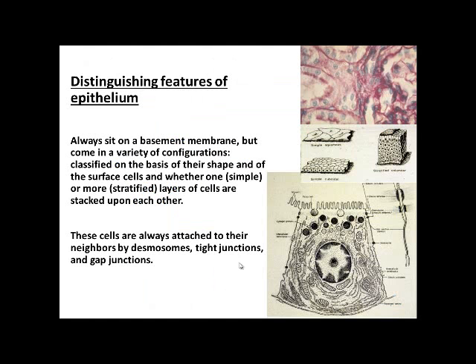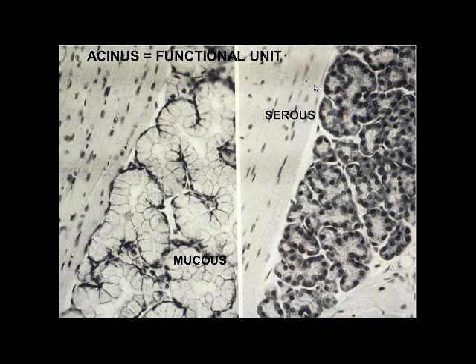So remember, we were talking about epithelium. There are different shapes of epithelium, but a characteristic of epithelium is they have junctions between adjacent cells. And those junctions allow cells to be attached to one another to form a sheet and to make a cavity. And here we see in the kidney where the cells have made a lumen or opening, and through there fluid can go through. And we're going to see that in the salivary gland today.